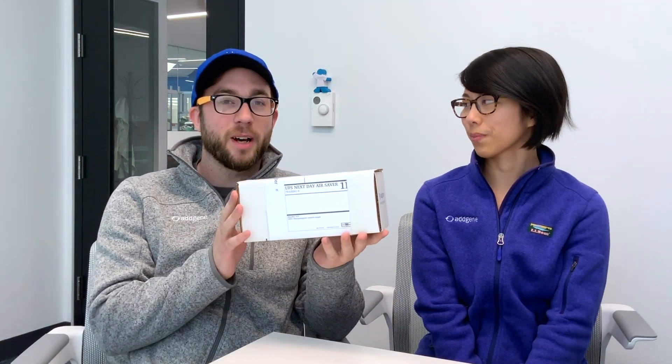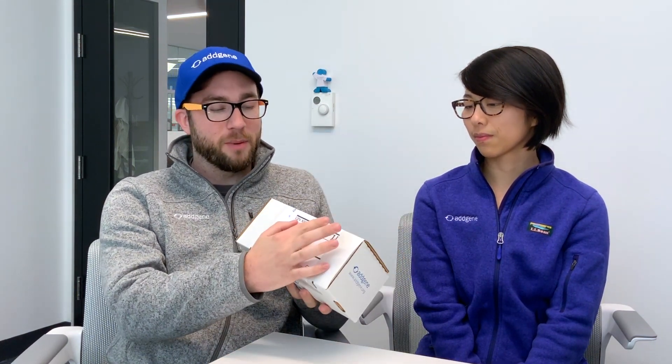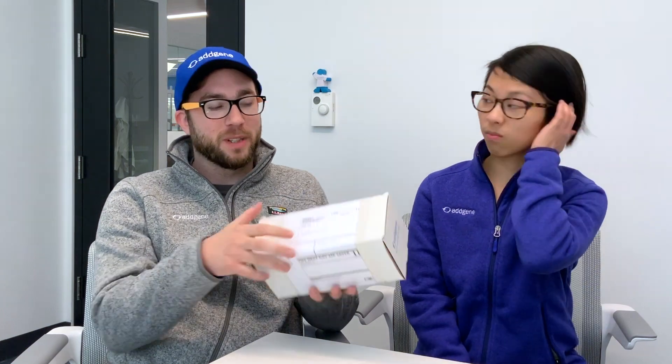So this is our standard Addgene box when you order a plasmid — this is what you're going to receive. You'll have your order number here, the tracking information will be here, and all the address information will be here.